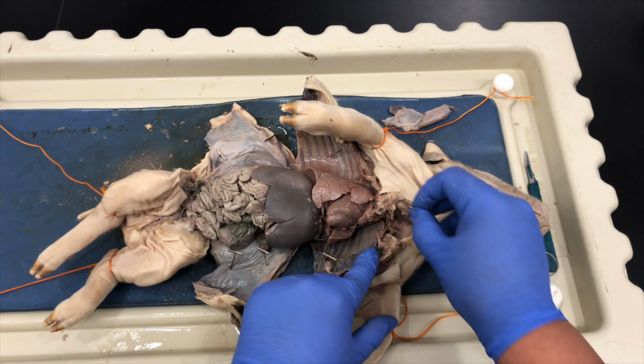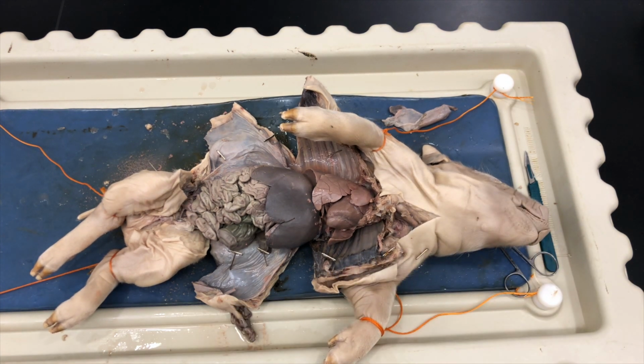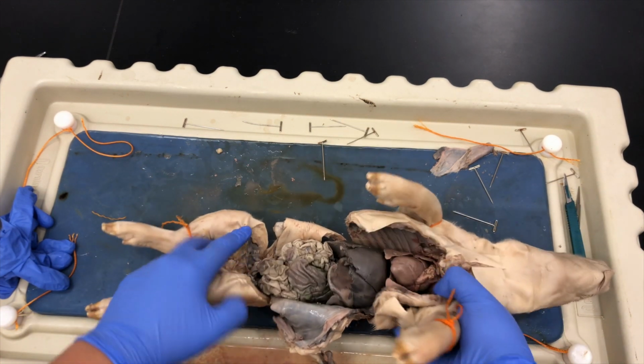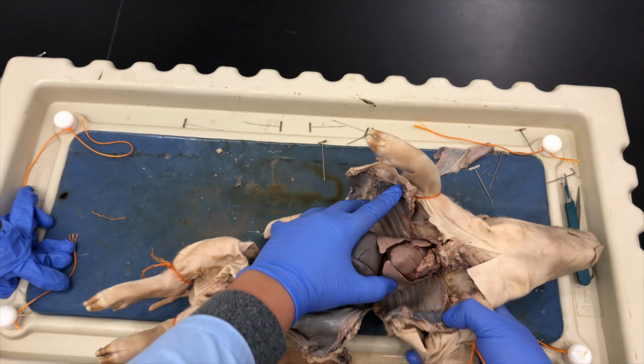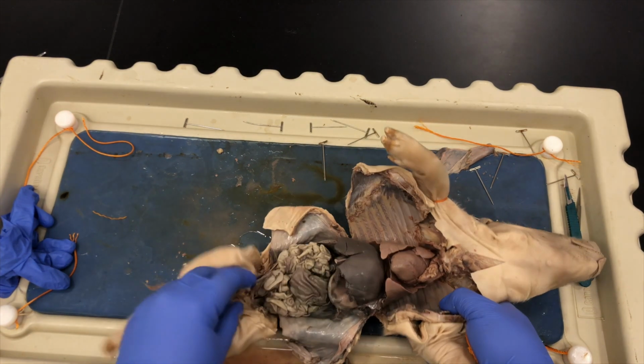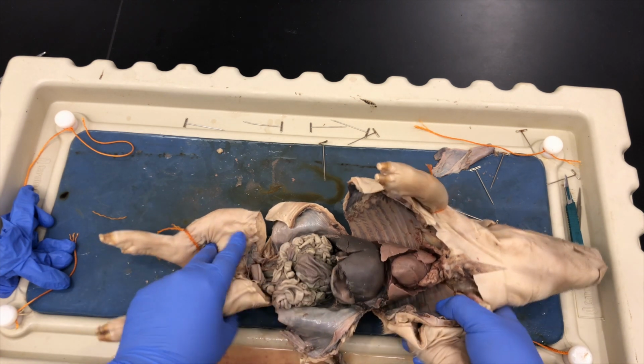Now that we have all the pins holding down the pig, we can see the internal organs. I went ahead and untied the pig, took out the pins so that I could hold it in my hands a little better, keep it nice and open so that you can observe the internal organs of the pig.